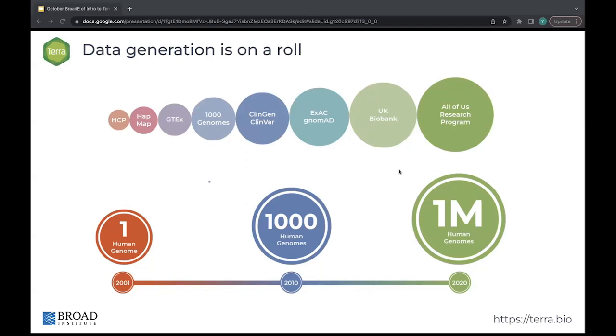And while this is amazing in theory, there's just so much data that it's hard to find the data you want, download and store the data, interpret and analyze file formats. There's tons of different file formats, and some can be confusing, especially if you're combining data from large data sets that might be using advanced compression, and sharing with collaborators in a way that's efficient and secure. And these are just challenges I've listed for finding and accessing your data. So this is before you even start analysis, and that comes with its own challenges too.